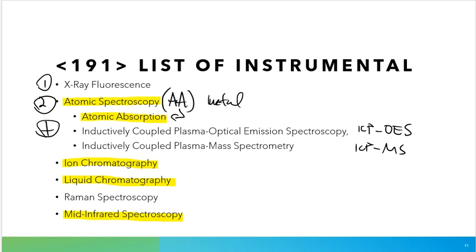We currently do have an ICP in-house. It's not operational right now because a major piece of that instrument has malfunctioned. And it's just not been on a priority list really for us, as it was a donated piece of equipment. So sooner or later we'll get that back up and running if it's not already running by the time that you watch this video. But we do have ICP capability, or we should have ICP capability at least.